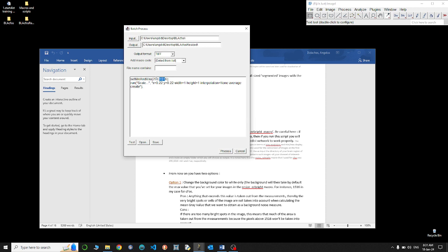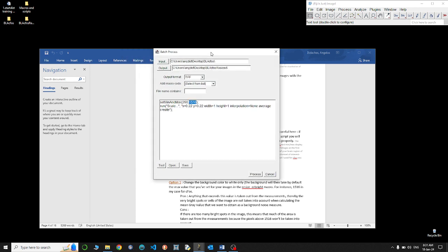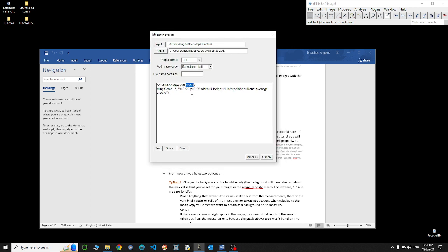This value, as I said before, is particularly important because the white background will also obtain this value when we make the white background in the next step. And this value will also be used for exclusion of pixels in the image. We're doing it because we want to isolate the area that is not the background, practically the segmented area. Maybe there is a better way to do it, but I couldn't do it otherwise, so that's why I'm doing it.